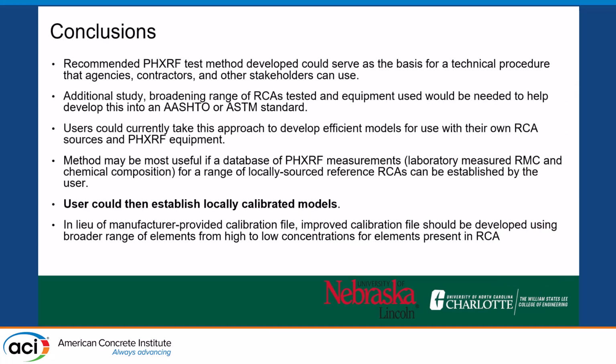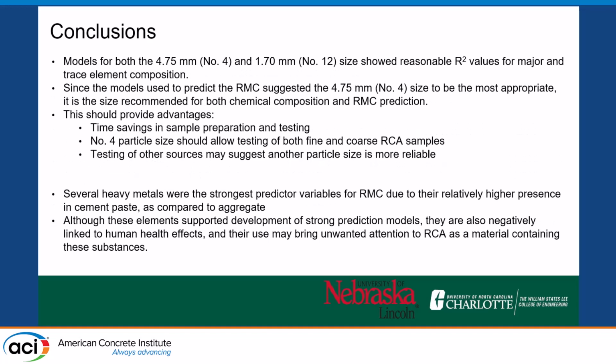So in conclusion, this could serve as a basis for somebody to develop their own database and predictive models. We need some additional study for more RCAs. Users can take this approach and work with it, develop their own reference set, their own predictive models that might work better. And in lieu of the manufacturer provided file, maybe make your own reference file for your device.